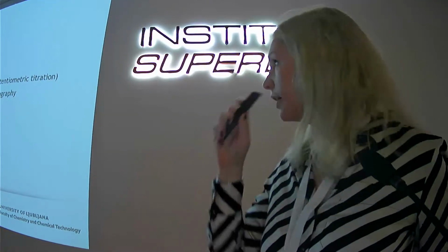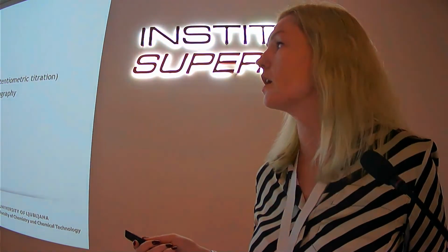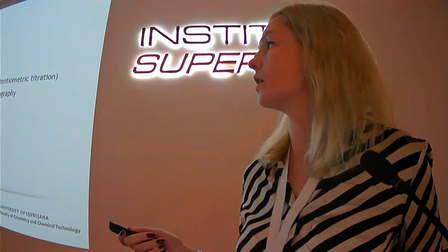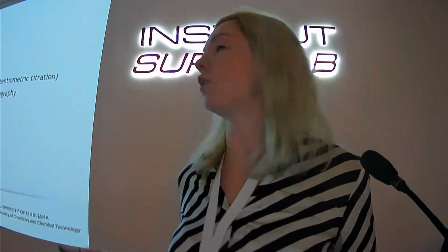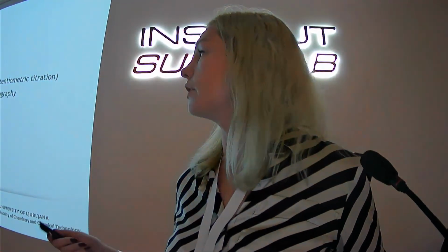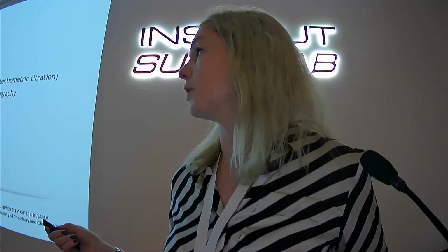Other characterization techniques, or characteristics, that you can determine for microplastics. So usually we are always also determining the number of particles per mass to have the concentration in volume and also in the number of particles in our experiments. Specific surface area, it's possible to measure, but usually microplastics have very low specific surface area because they are not porous materials.